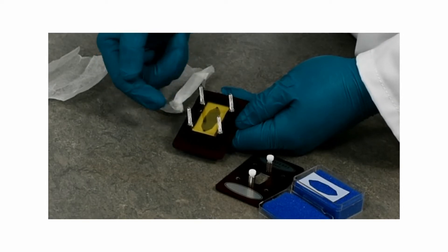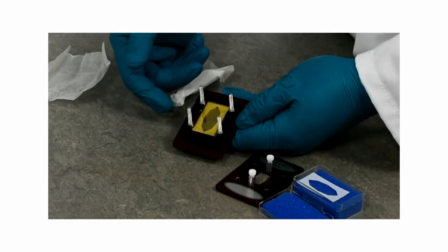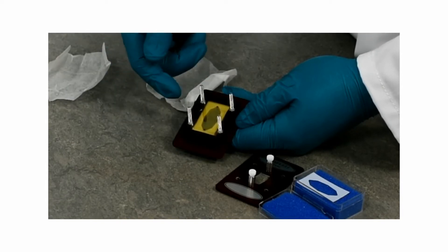If the spacer is blocking the hole, reassemble the cell ensuring that the spacer isn't in the way.